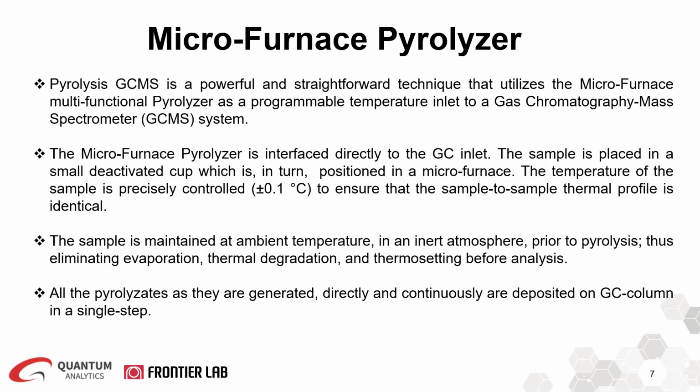Now, what is the pyrolysis-GC technique? Pyrolysis-GC is actually a very powerful and straightforward technique that utilizes the microfurnace multifunctional pyrolyzer as a programmable temperature inlet to a gas chromatography mass spectrometer, GCMS system.